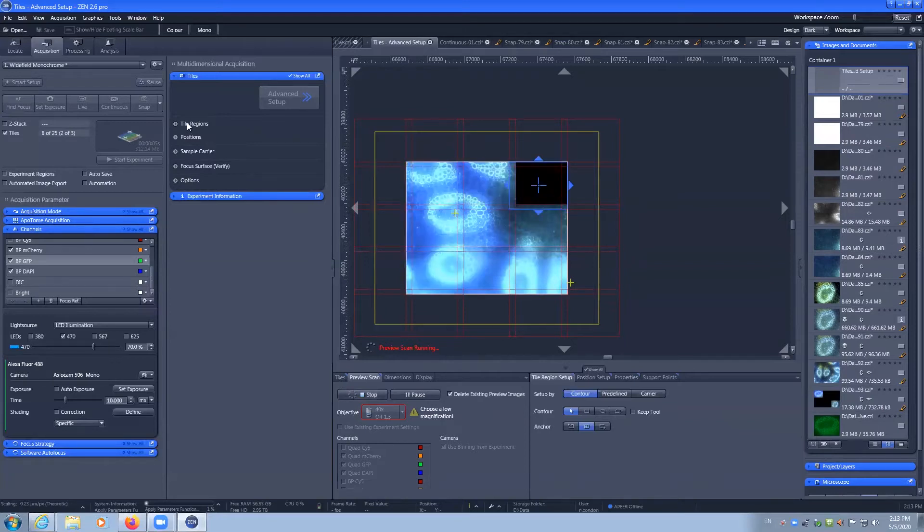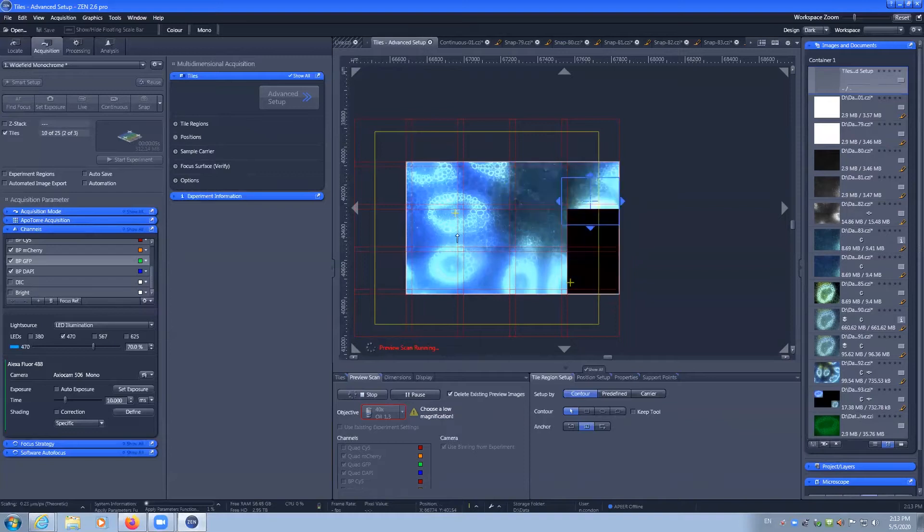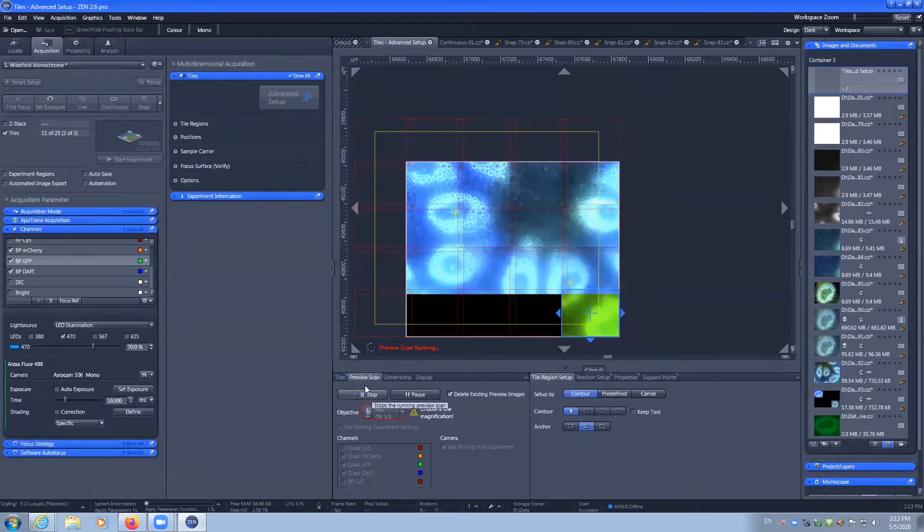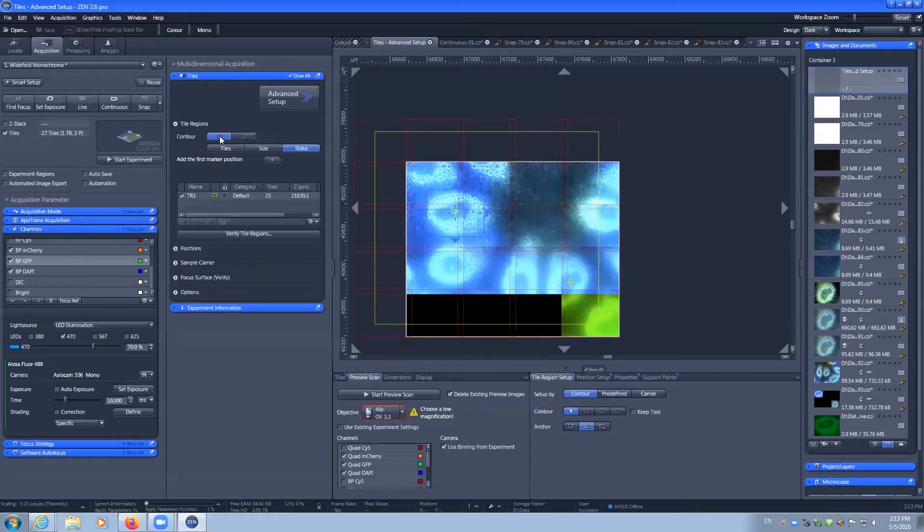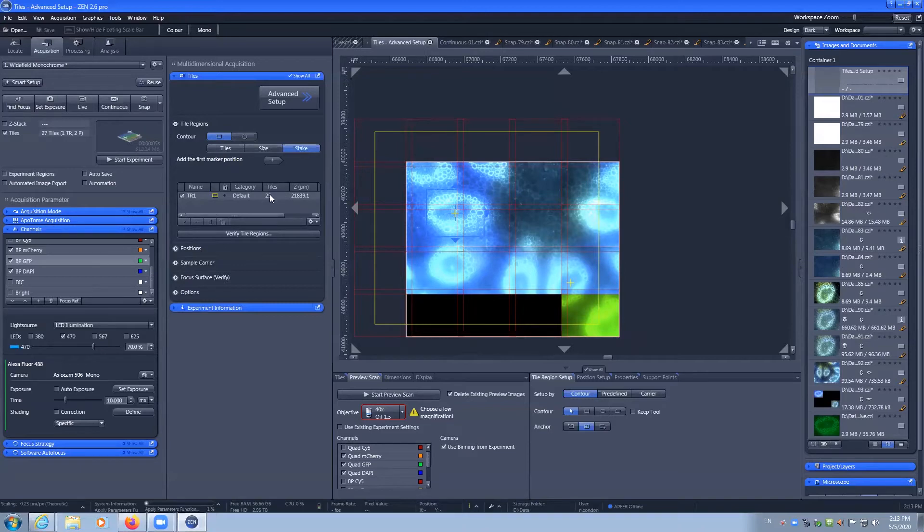And importantly, my tile list is being updated with these settings. So I can stop this preview scan, load up my tile list, and from what I've drawn I have 25 tiles.